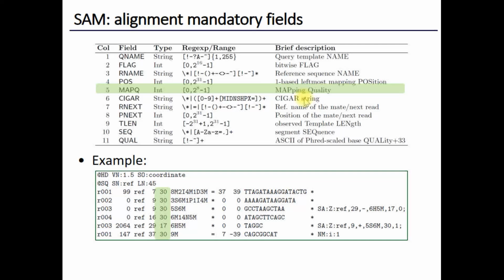it was proposed by Heng Li and Richard Durbin in 2008. It is to deal with the problem that the sequence quality is not good, so the original pairwise sequence alignment score cannot be used. The mapping quality score considers both sequence similarity and sequencing quality. Therefore, in actual data analysis, we often use mapping quality to filter the number of true reads mapping to the genome rather than the sequence alignment score.